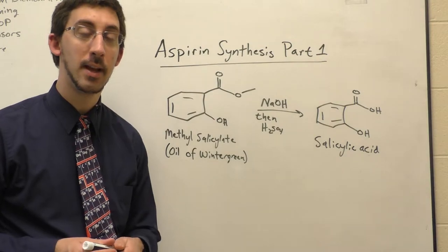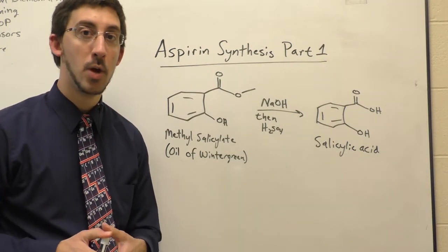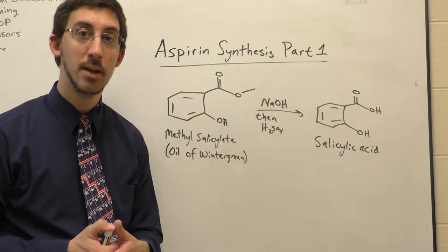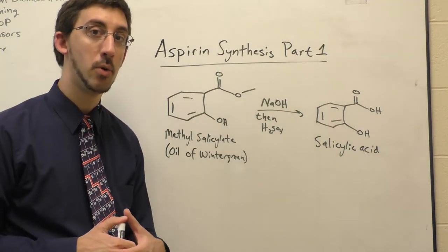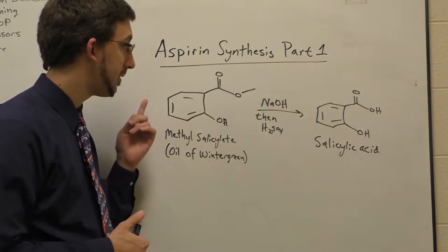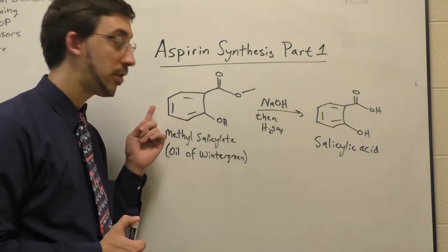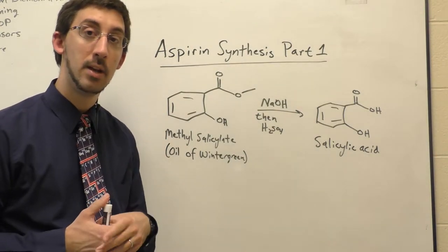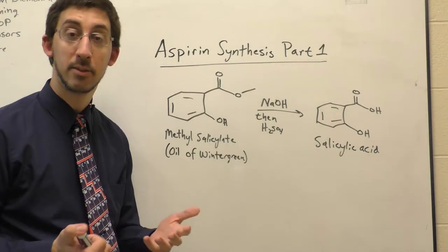This is the first part in a fun two-part experiment where we're going to be synthesizing a common headache medicine, aspirin, starting from a natural product. Oil of wintergreen is also known as methyl salicylate. And we're going to start with this natural product and do two steps in order to produce aspirin.